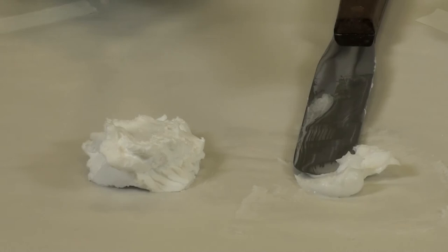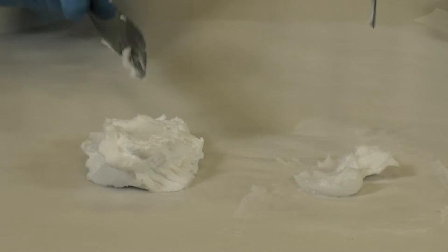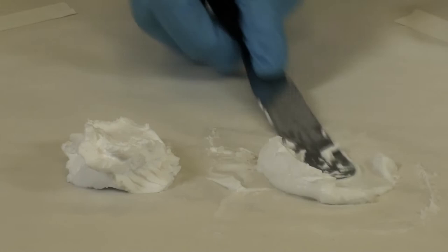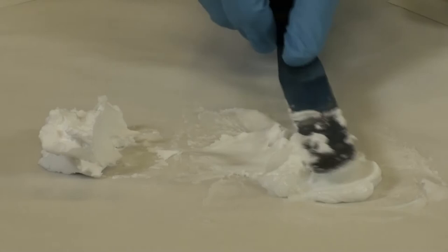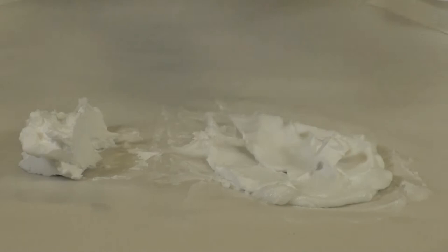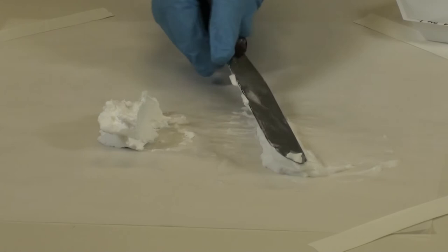Now we want to geometrically mix the aquaphilic into our urea triamcinolone. So take about an equal amount, and then you're going to use that to mix it together uniformly. Then take another swipe and go ahead and use that. As your cream gets larger, the larger spatula will be a little easier to use to mix.